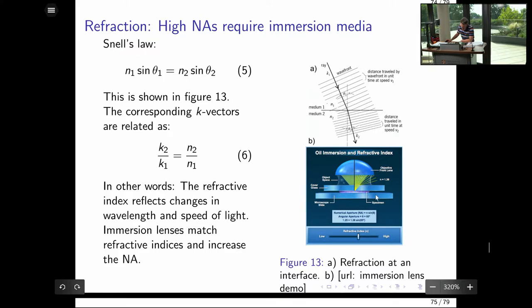So here's a microscope slide. There's a specimen, maybe sandwiched here between two glass slips. This top glass slip is a thin slip of glass, which is really just there to squish the sample together and to provide good optical access, a flat optical axis, so we can image through it, and then bring the objective close and focus on a point in the sample.